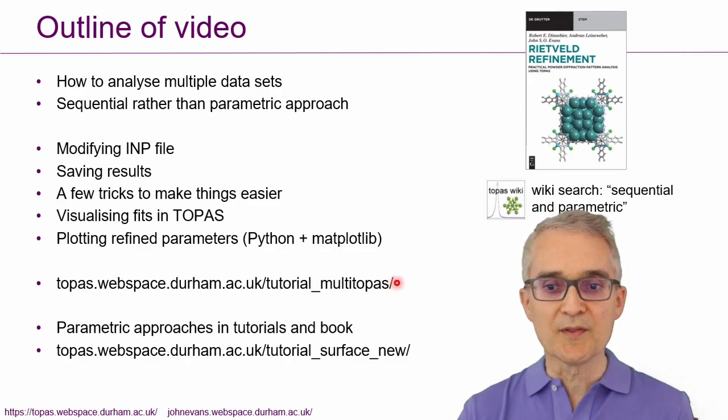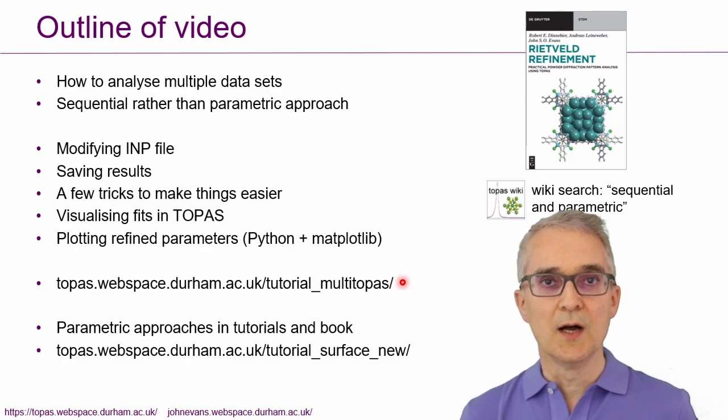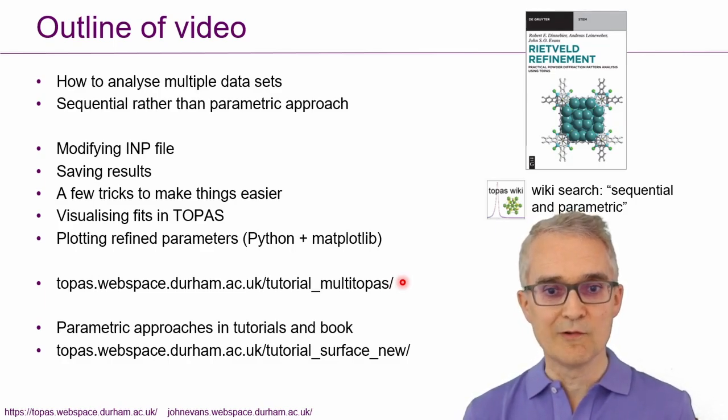So you'll probably want the files downloaded to look at as we go through the tutorial. They should be all available from the web link that's by my laser pointer on the screen.